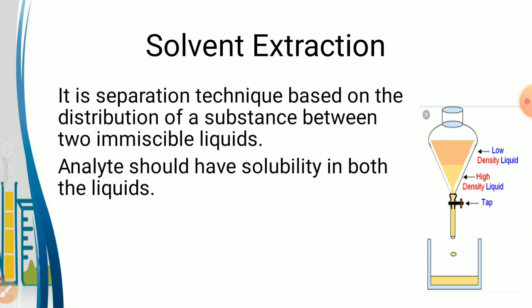So let's start with solvent extraction. What is meant by solvent extraction? Solvent extraction is a method of physical separation of a mixture. It can be applied to handle large as well as small quantities of material. The technique is simple, rapid and convenient. It requires simple equipment and is applicable to organic as well as inorganic materials. It also gives good accuracy even at trace levels.